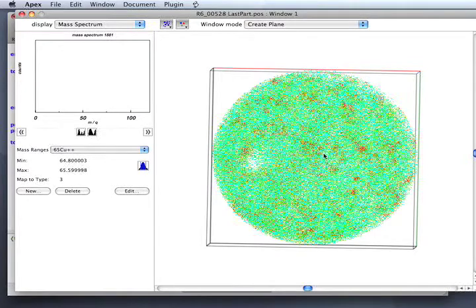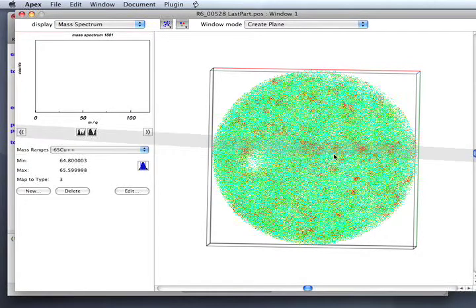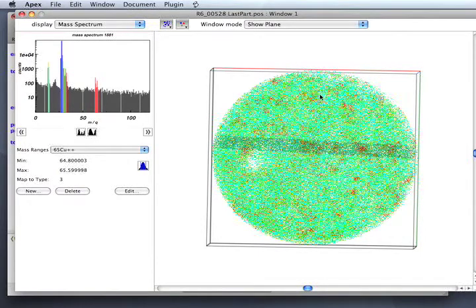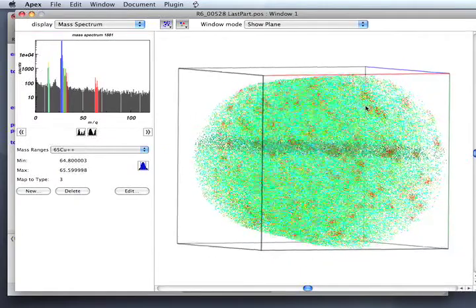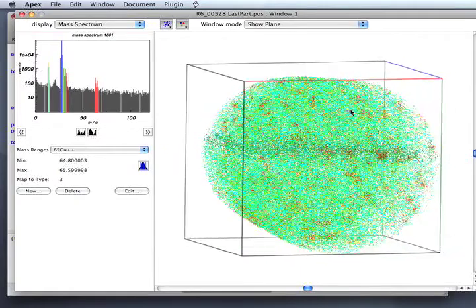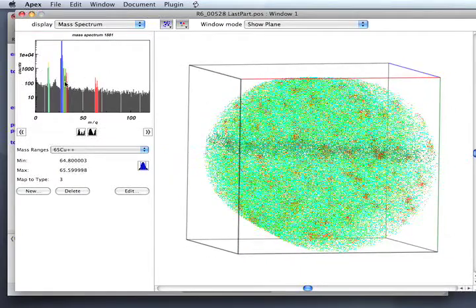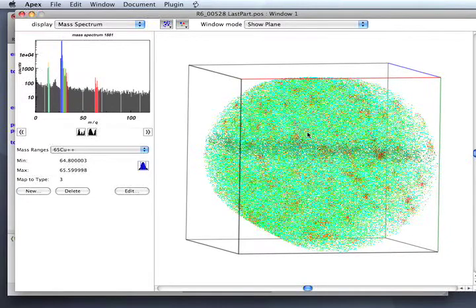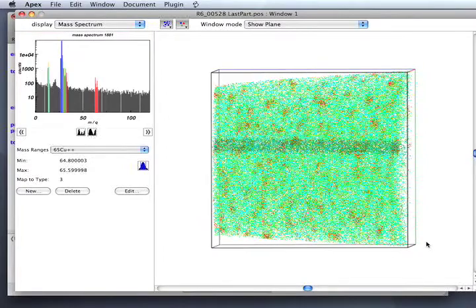I'm just going to drag out a plane, click in the middle of the plane and then drag out the edge. Defining a point that's in the plane and dragging to define a thickness shows us a plane in the sample. You can see in the mass spectrum the atoms that are inside that plane.